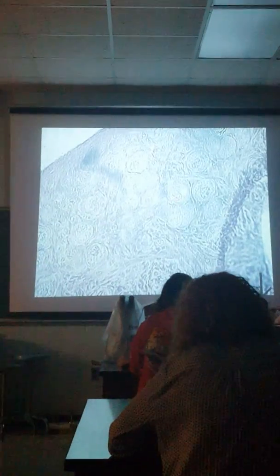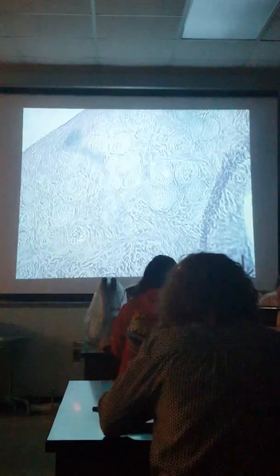So these here, they're not very differentiated. Sometimes you can see an oocyte in the middle, but it's just simple squamous surrounding it. So primordial follicle, primary oocyte. And there's just clusters of them up near the periphery. See how they're all lined up?